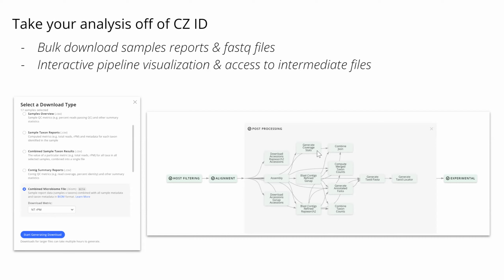And then here's an example of our interactive pipeline visualization. If you click into any of these steps, a modal will slide out that gives you access to intermediate files, tells you what the step is and what it's used for, and the parameters that were used.